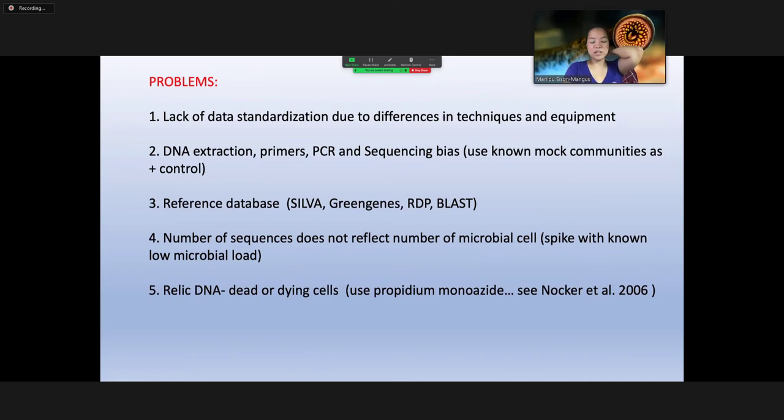And also different sequencing platforms. Now it's being dominated by Illumina. PacBio, they're doing a lot of 16S amplicon sequencing. This is an equipment that sequences longer 16S instead of just regions of 16S. So 16S is a biomarker. This is for undergraduate students. 16S is a biomarker used for bacteria, or the barcode that we use, so to speak.